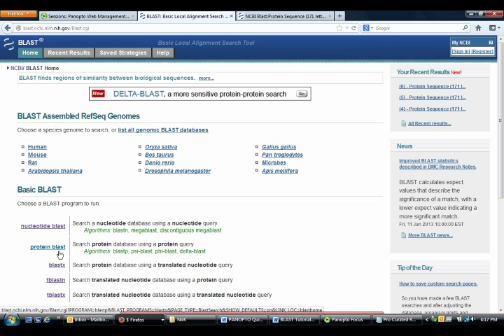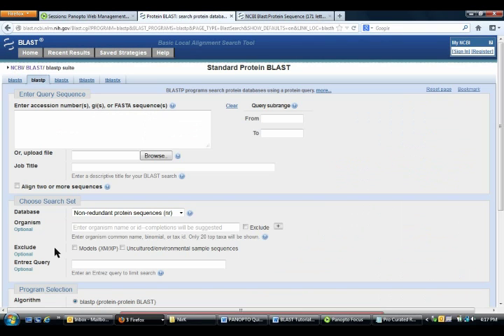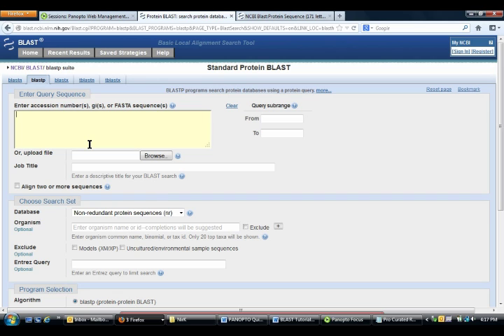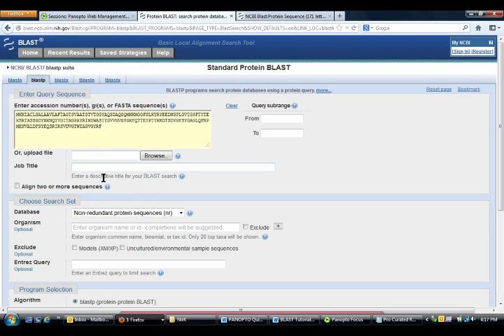Click on protein BLAST. Into the box labeled enter accession numbers, GIs, or FASTA sequences, paste that sequence that you copied.